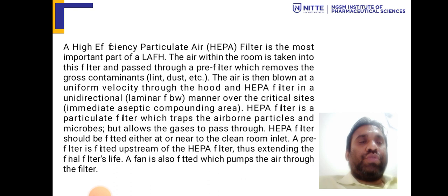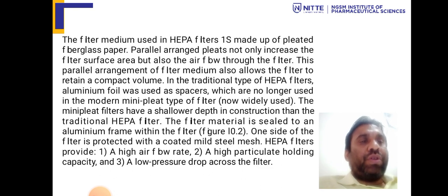HEPA filters should be fitted either at or near the clean room inlet. The pre-filter is fitted upstream to the HEPA filter, thus extending the final filter's life. A fan is also fitted which pumps the air through the filter. The filter has a size of about 0.3 or 0.22 microns. So this is a HEPA filter.